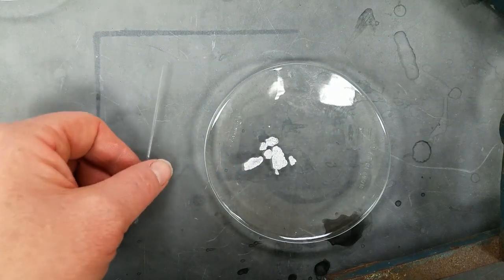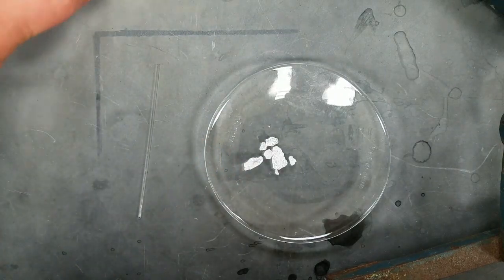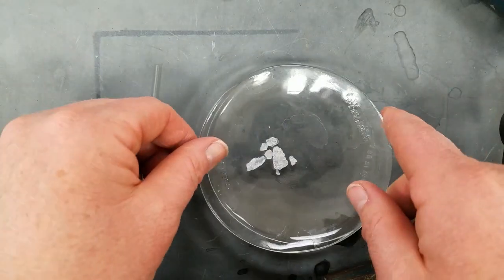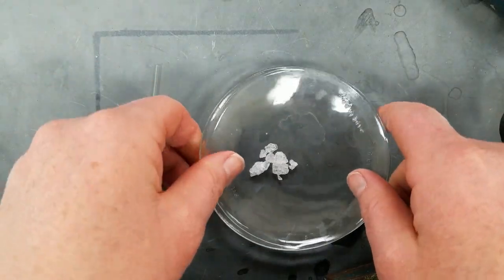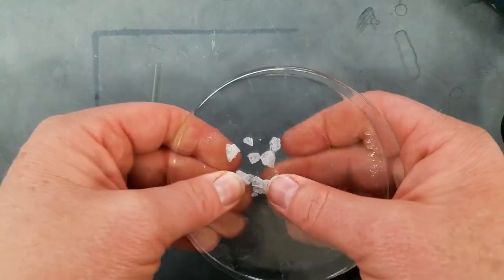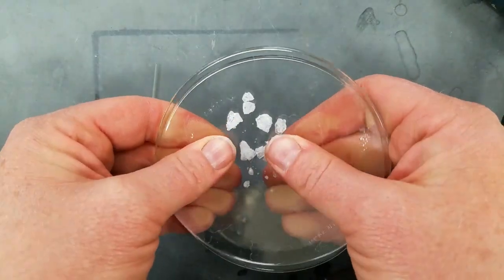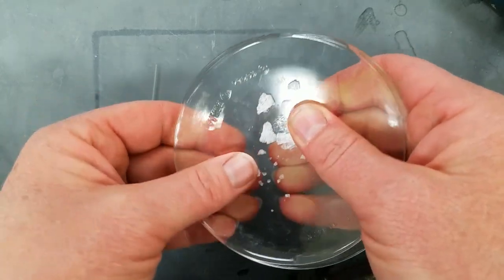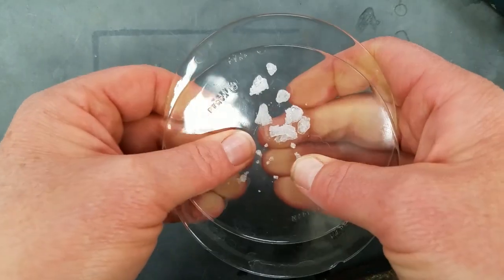The first thing we need to do is crush our solid so that we can get it into that little tube. There's lots of different ways to do this. You can use a mortar and pestle or we can use two watch glasses to crush it into smaller pieces.